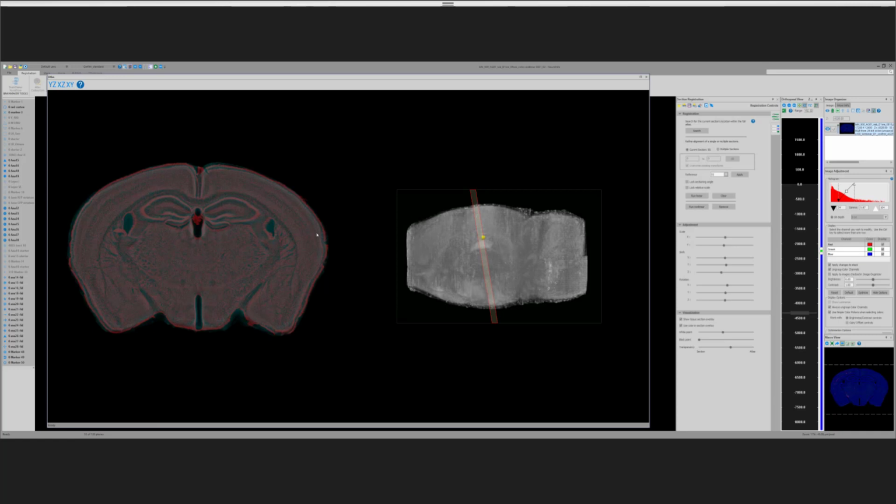Anyway, the process we use, after we've identified the optimal transforms, the parameters required to match, and again, the parameters used for the linear transform are shifting in the X, Y, and Z axes and rotating in X and Y, is that we can then lock those and do multiple sections.